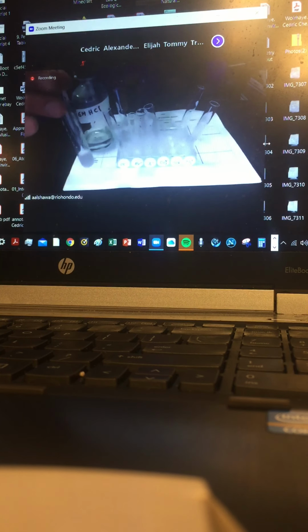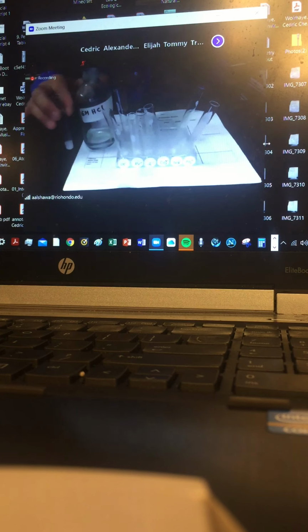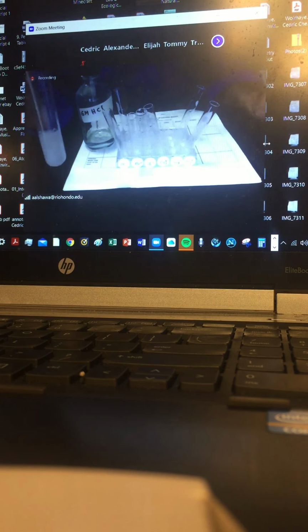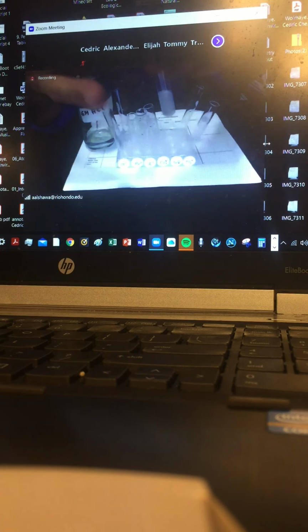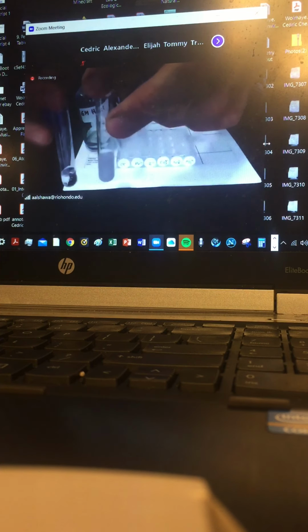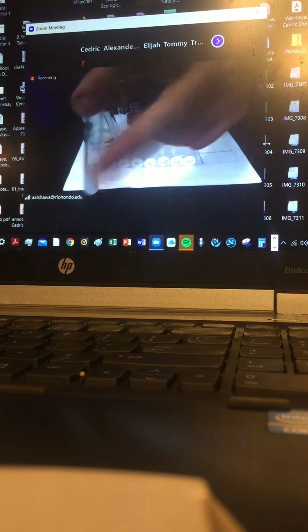Now let me test the acid addition to the sulfate. So here's the sulfate, and here's the acid. Okay, so the cloudiness remains. I agree. So we're also comparing to the carbonate. So here's the carbonate. And here's the sulfate. This is the sulfate, and this is the carbonate. Carbonate, sulfate.